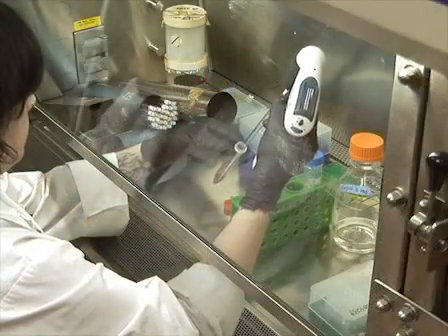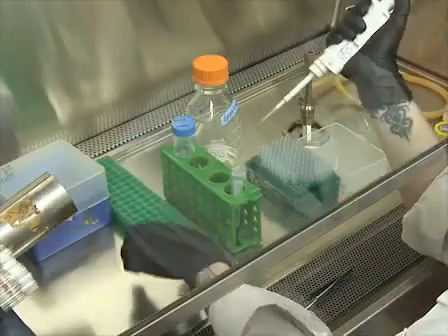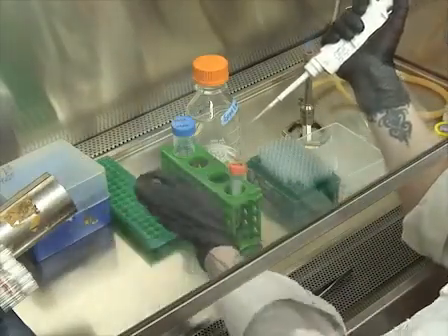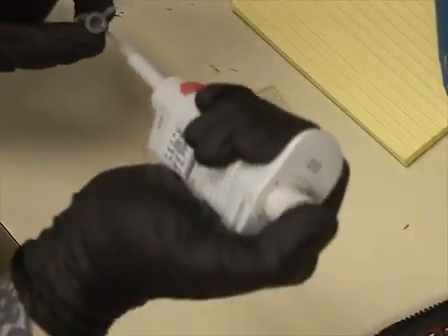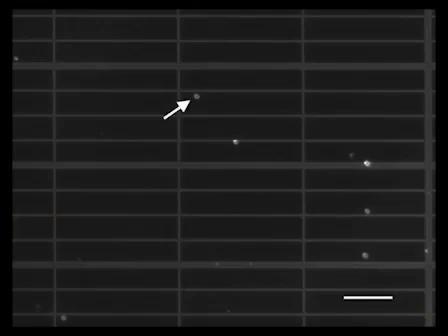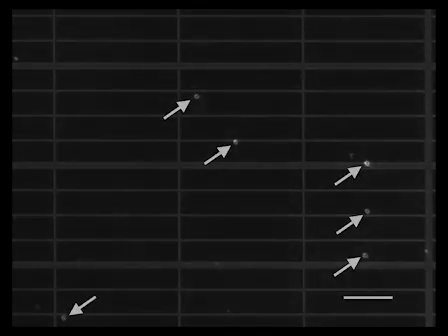Once you have well triturated the sample, take a 15 microliter aliquot and mix it with an equal volume of trypan blue. Take two 10 microliter samples and load a hemocytometer for cell counting. Count the cells from 3 fields in each section for a total of 6 fields. Average numbers and calculate your cell density, keeping in mind the sample is diluted in trypan blue.